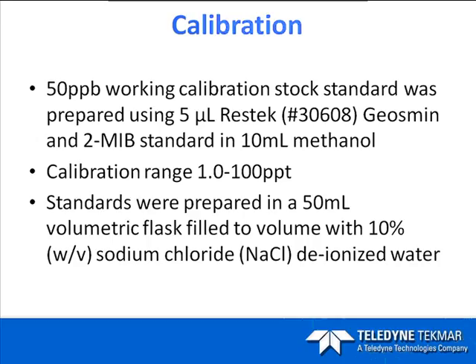Now, sodium chloride is often used to help lower the partition coefficients of some compounds, improving the purge efficiency of certain analytes. A lot of times you will see this in static headspace analysis. In static headspace, there are a lot of things going on when those analytes are trying to reach equilibrium. Anything that we can do to help move those analytes out of the matrix and into the headspace faster is a different way of altering those partition coefficients.